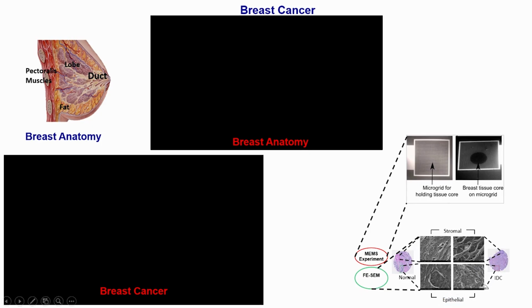When you see the SEM image of the tissue, normal versus cancer, we can clearly see that there is some kind of roughness in the cancerous tissues, while the normal tissues or the benign tissues, right, they are comparatively smoother compared to the cancerous tissues. So, what does that mean? That means that if the morphology of the normal tissues is different than the cancerous tissue, then we can probably understand its electrical property, and it should be different, while if the electrical property is different, its thermal property can also be different.